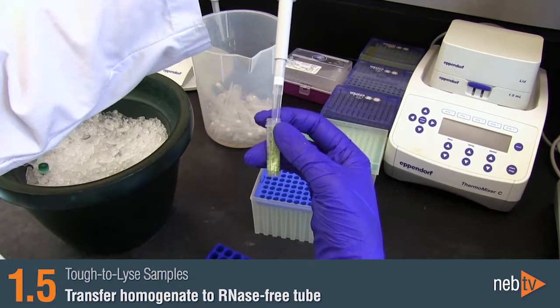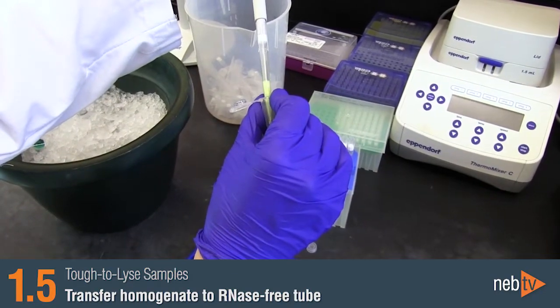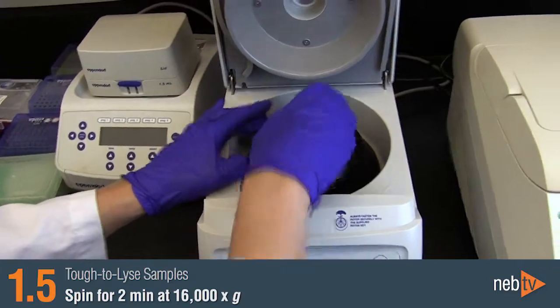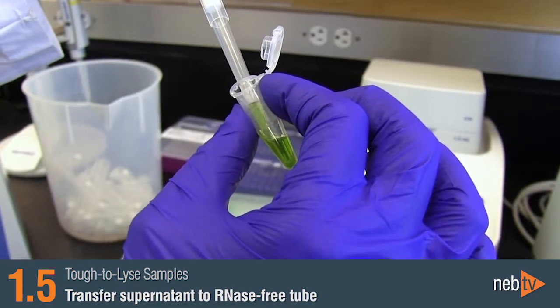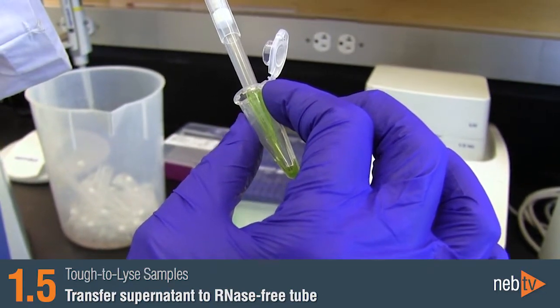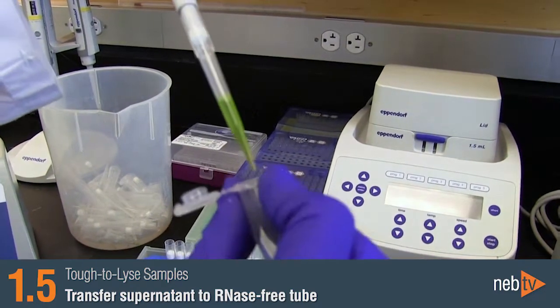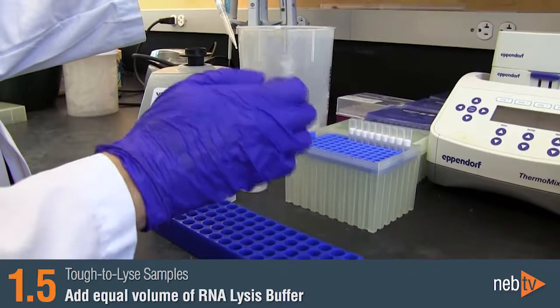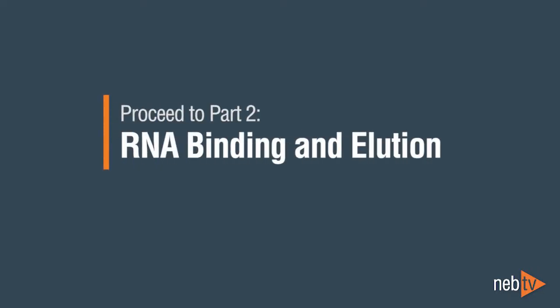Transfer the homogenate to an RNase-free microfuge tube and spin for two minutes at 16,000 times G to pellet any debris. Transfer the supernatant to an RNase-free microfuge tube. Add an equal volume of RNA lysis buffer and vortex briefly to mix. Now you are ready to move on to Part 2, RNA binding and elution.